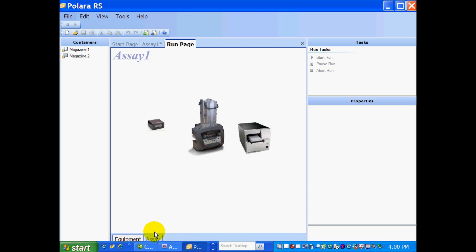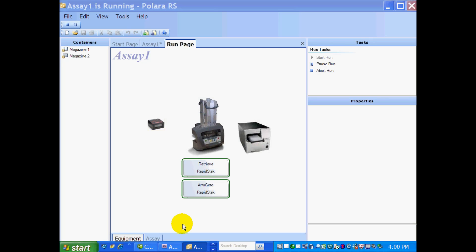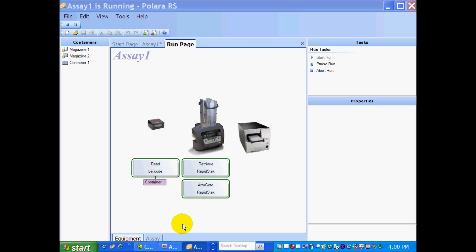And what will happen is you'll see a pop-up of several of the functions as it's happening live. So you can see now I'm retrieving Container 1 from the RapidStack. It's going to the barcode reader. And it's going to prep Container 2.